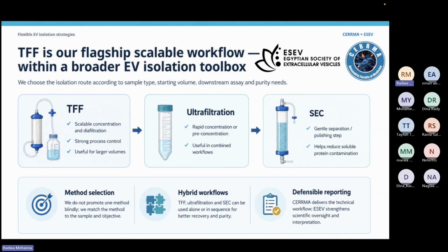We started then to overcome this with the ultrafiltration, which may have solved some of these problems, but still have problems, mainly the plugging of the filters, which is also overcome with the tangential flow, because this does not happen for the flow of the conditioned media or whatever is the source, while isolating the EVs.